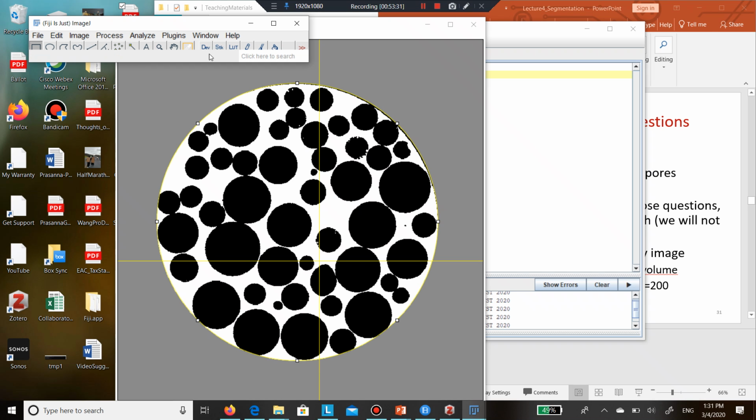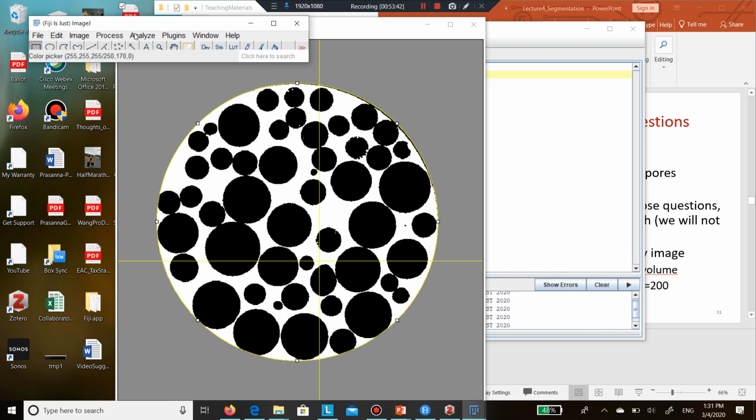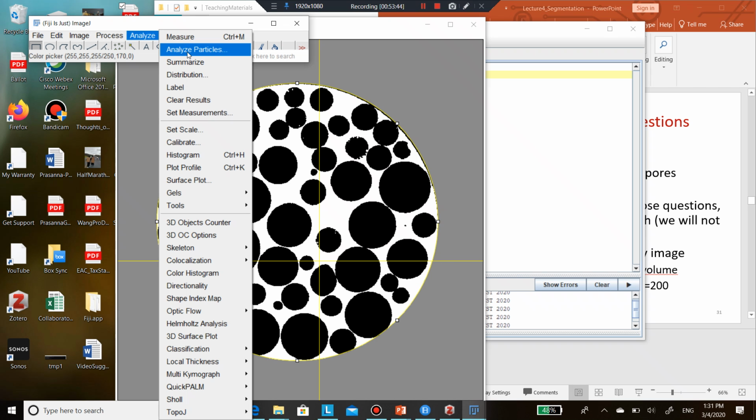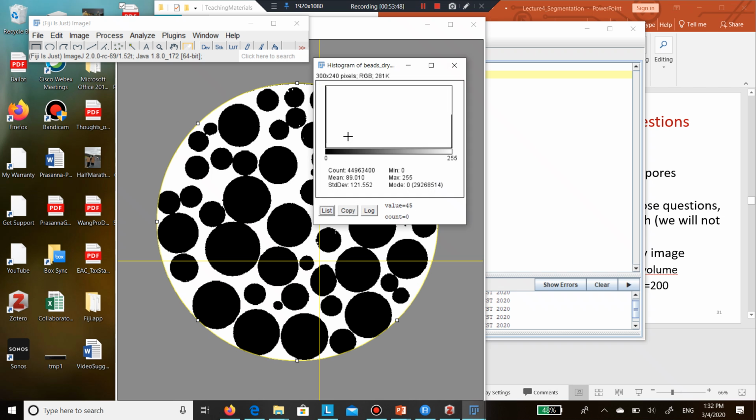Okay. So now if I do a histogram, oh, there's two. I'm going to go through analyze histogram. Yes.